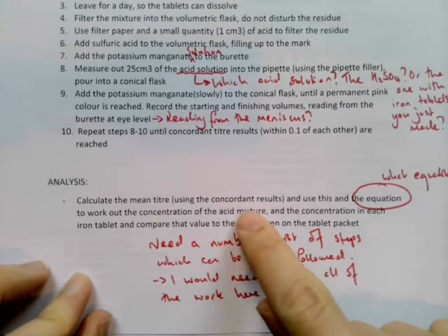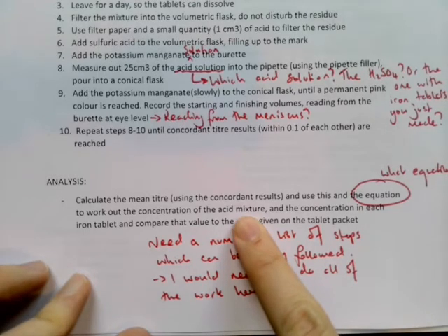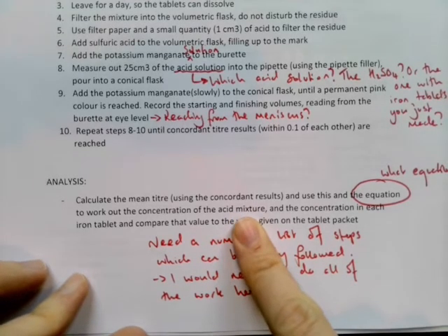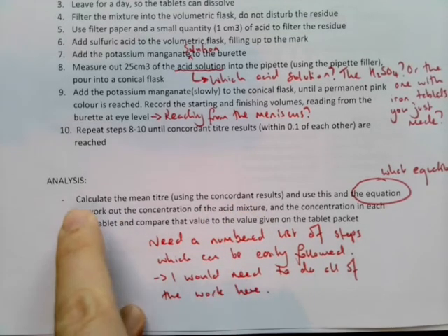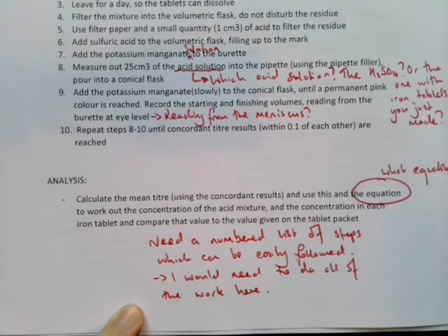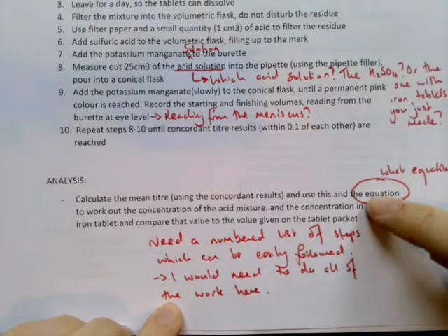Now imagine if you're doing this experiment 6 months from now, that's not going to be a very, very helpful direction. You're going to want to see something like step number 1. Calculate the number of moles by doing this exact calculation. Step number 2. Calculate the number of moles of Fe2+ by multiplying your answer in step 1 by 5, because that's the ratio of manganate ions to iron 2 ions in the overall equation. So don't feel like it's cheating to write in exactly what to do.